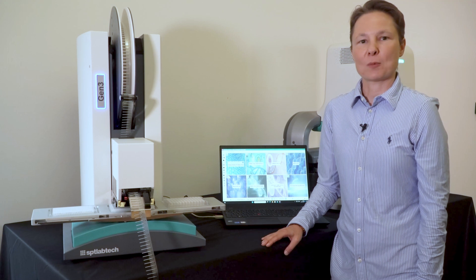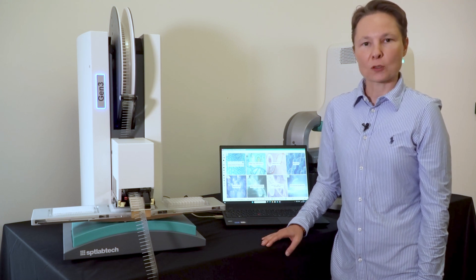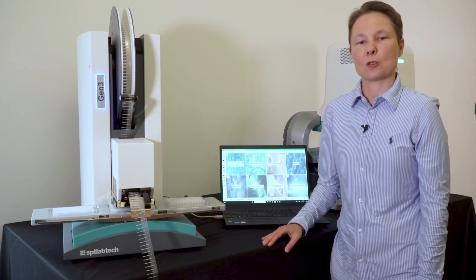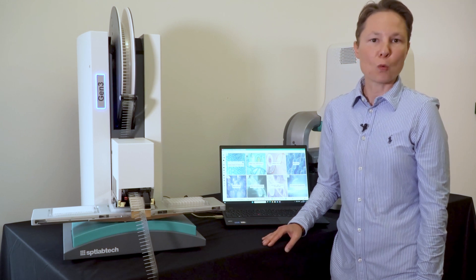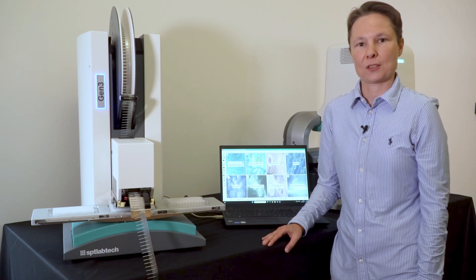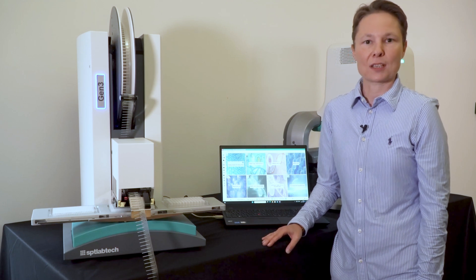Mosquito Gen3 operation is supported by visual application-led Mosquito software — software that was developed in collaboration with leading scientists to facilitate faster implementation of miniaturized protocols. From simple PCR and qPCR setups, library quantifications, to more complex and challenging workflows like bead cleanups, NGS library preparations, and single-cell transcriptomics. The software comes with a selection of plates and methods that are ready to use.